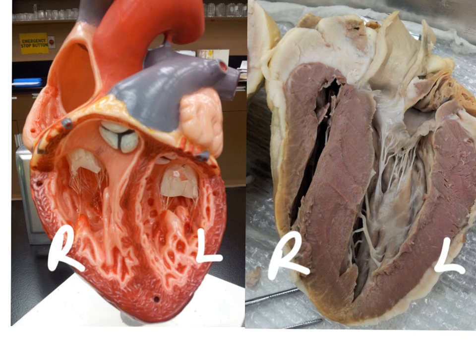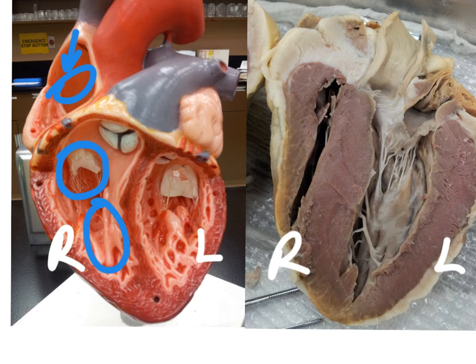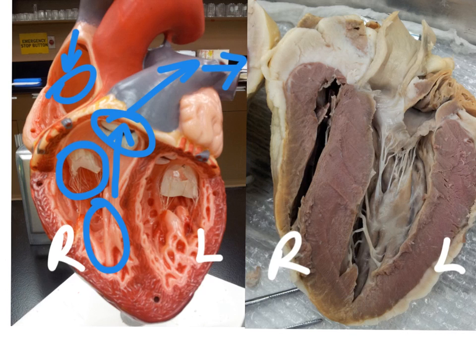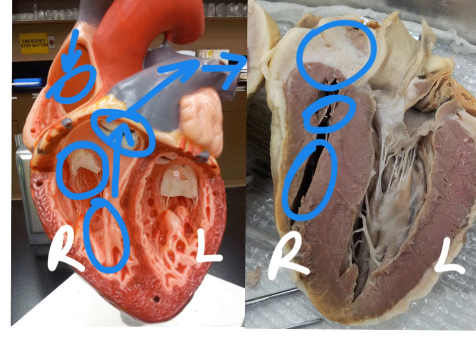Let's follow the path of deoxygenated blood coming in the superior vena cava into the right atria. It would then go through the tricuspid valve into the right ventricle and then back up out the semilunar valve into the pulmonary trunk and then the pulmonary arteries. On the sheep heart, we're not necessarily seeing the vena cava or the atria because the section wasn't quite done to show that. You can slightly see the tricuspid valve and here would be the right ventricle, going up and out the pulmonary semilunar valve and out the pulmonary trunk.